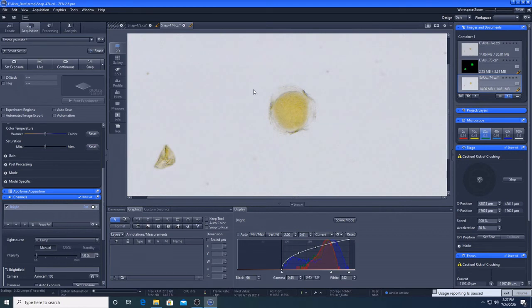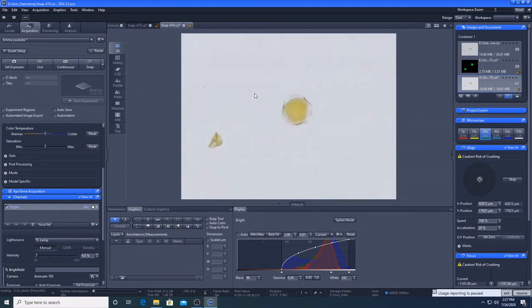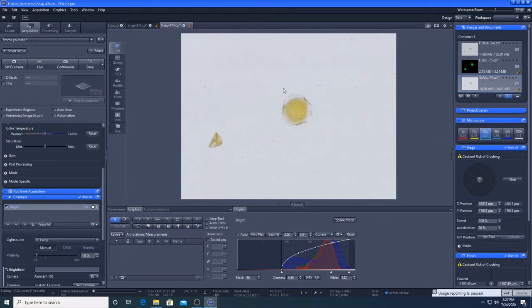You can see that it's still maybe a little bit grainy on the white background, but we've definitely got rid of the beige colouring, and we've got rid of that slightly checked effect.